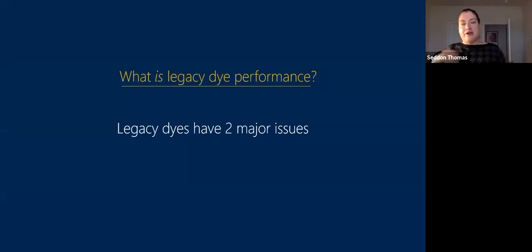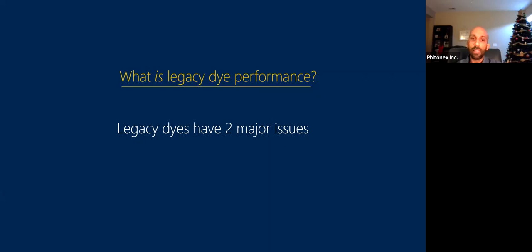Anson, we've already got a question. I know you'll be getting into this later, but just since you were just talking about separation index and staining, we've got a question in terms of what is the difference between 70S and 120S. Oh yeah, we're definitely going to get into that later on, but basically it's the fluor brightness. If you think about the wattage on a light bulb, that's pretty much the same thing that we're doing with our S designation. So the higher the S, the 70S is going to be about 2.5 times brighter than the 40S version. So it's going to have a higher separation index.